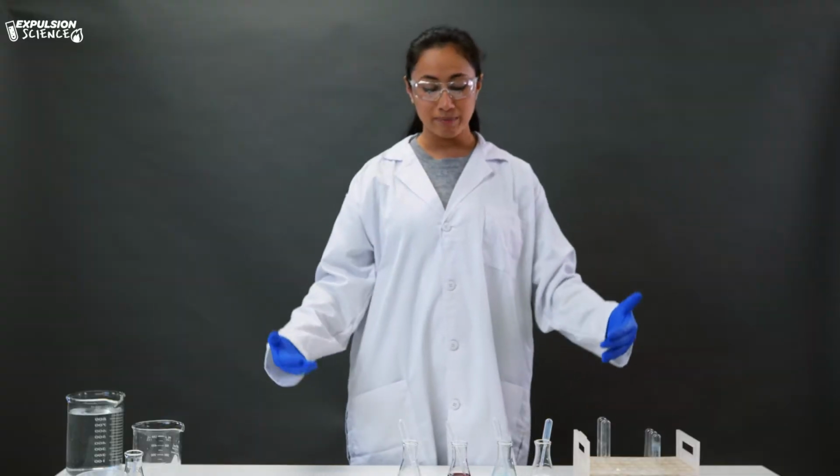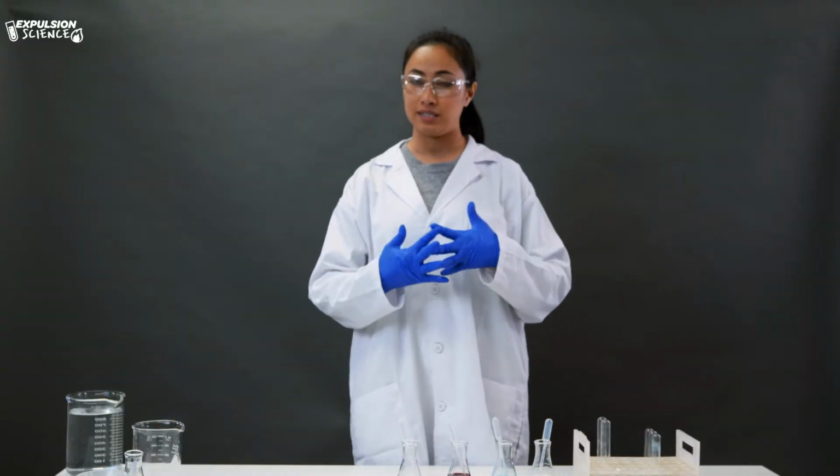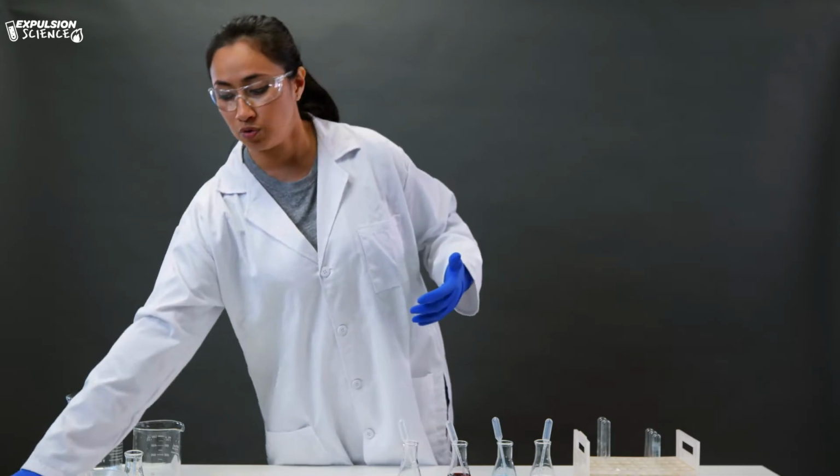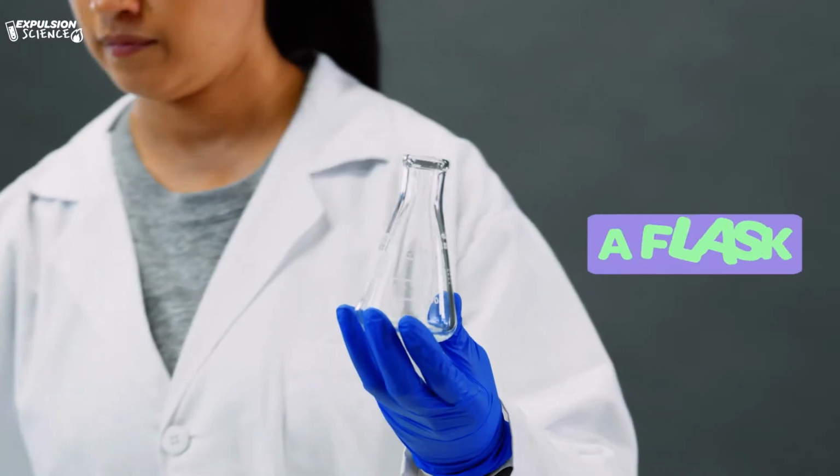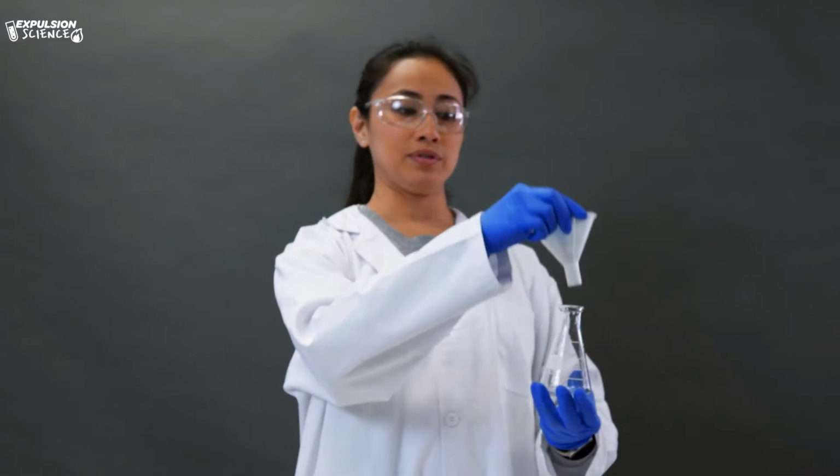Now, once we mix these different substances together, we will need to separate the contents of our new mixture. So we are going to be using filter paper. We've got a flask and our funnel to hold our filter paper.